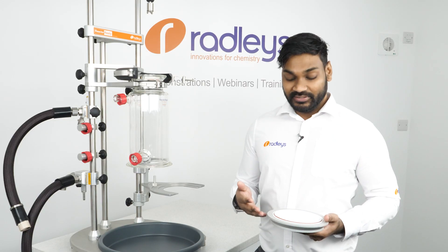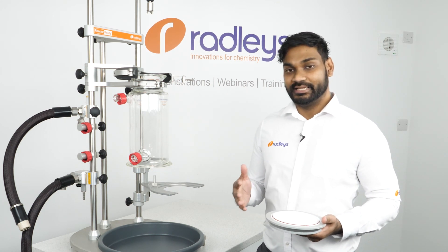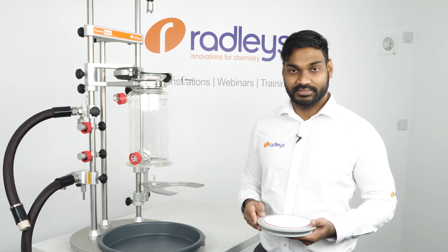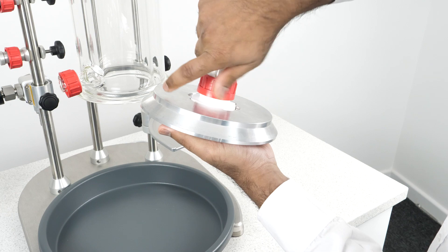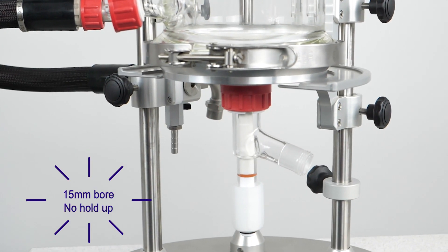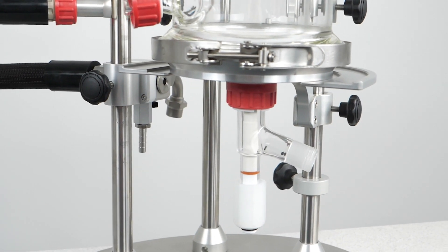Then goes the filter plate gasket, which is also made out of PTFE or PEEK, just like the bases. The filter base then locks into this aluminium filter cup with a bayonet fitting. The aluminium filter cup ensures that when we clamp the base onto the vessel, the risk of damaging the base is reduced and the risk of leaking from the base is minimised. We can then attach our bottom outlet valve to the filter base and secure it using this fitting. Our bottom outlet valve has a 15mm bore to ensure there's no hold-up when draining the vessel contents, and it can also be easily removed for cleaning.